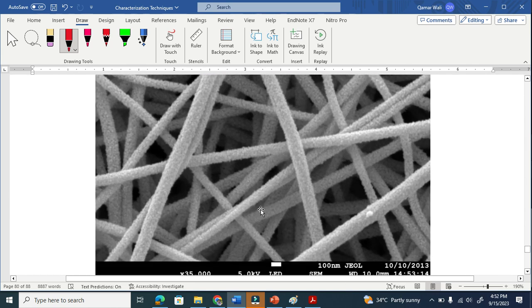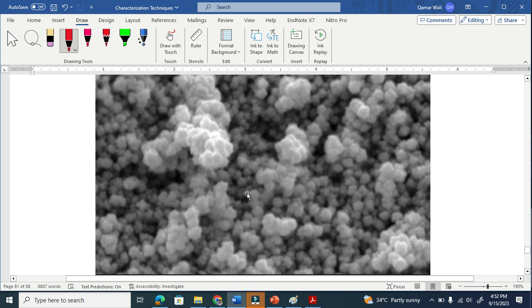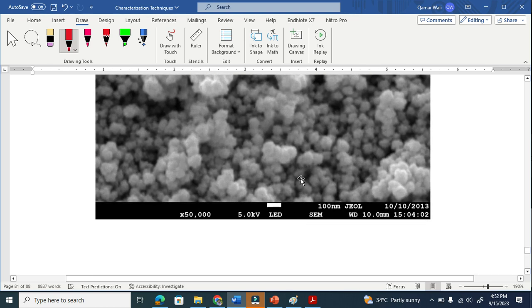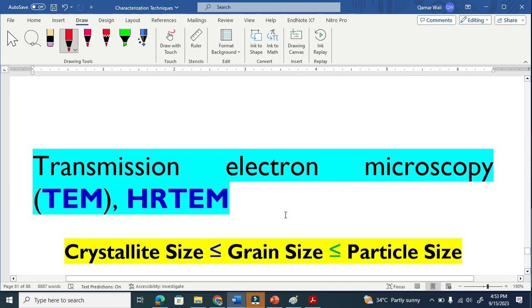Similarly, here we have nanofibers. Look at this scale here — if you take this scale and measure this fiber, it is below 100 nanometers. So it is also clear that FESEM can easily calculate this. This is another image and we can see this is at the nano scale.